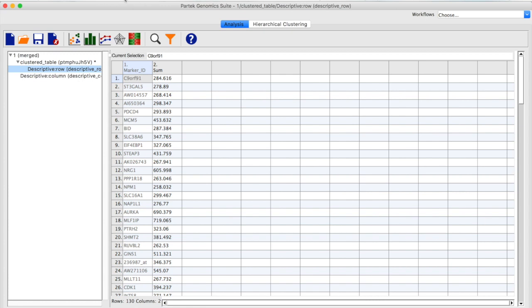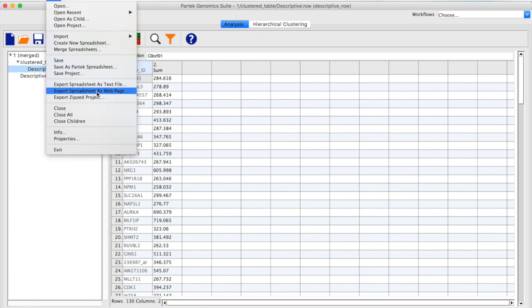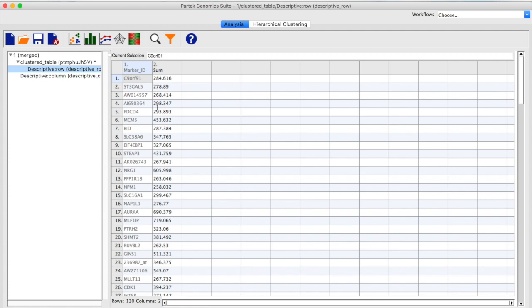What I'm going to then do is save this as a text file, and we will upload this. As I save that as a text file, we will then upload it into Correlation Engine and see what that program has to say about the biology.